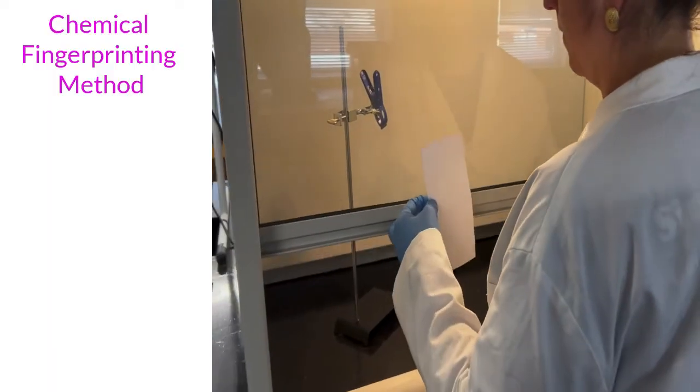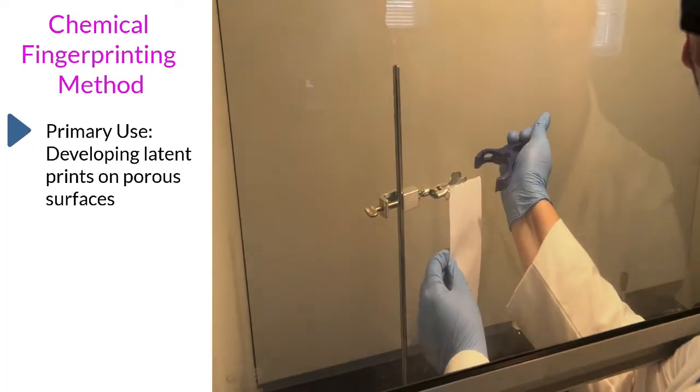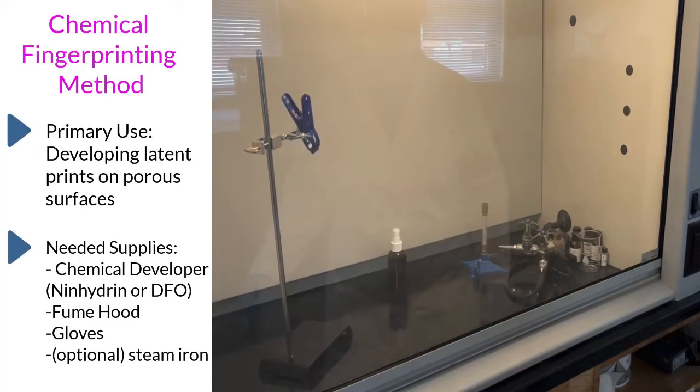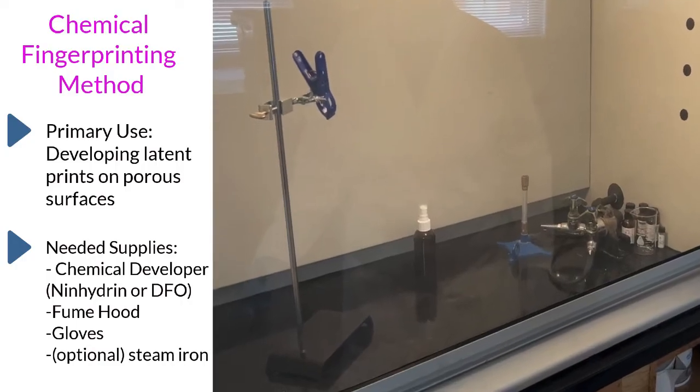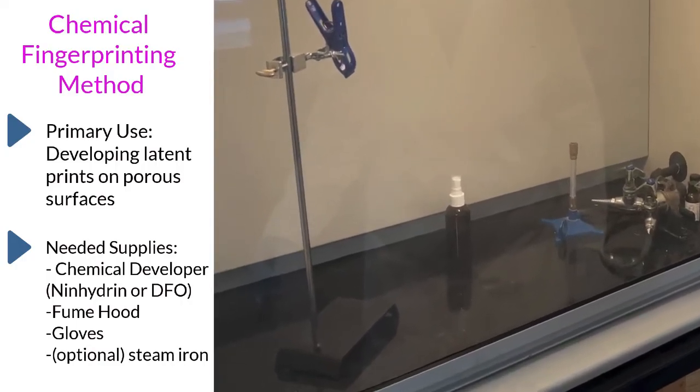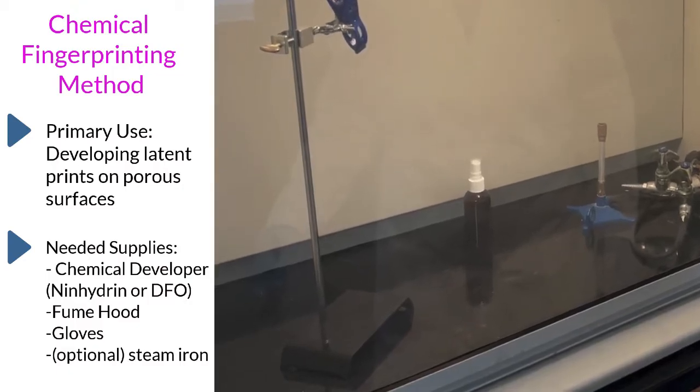Developing latent fingerprints with chemicals is the preferred method for developing prints on porous surfaces such as paper. The supplies needed for chemical development include a chemical developer of either ninhydrin or DFO. Note in this example we will be using ninhydrin. A fume hood, gloves, and a steam iron may optionally be used to speed up results.